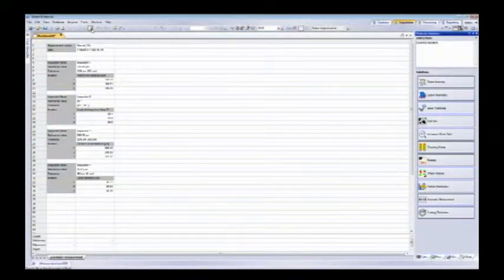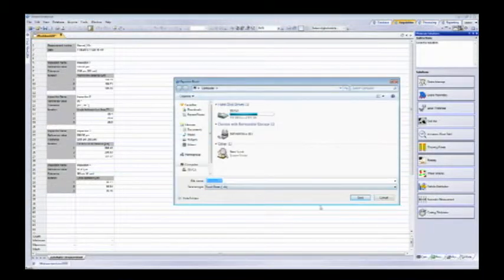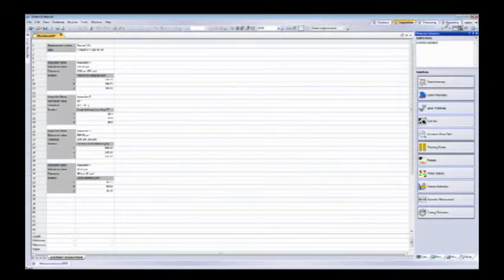One thing to mention, on all these solution modules, when you're finished, you'll get kind of a workbook feature showing all of the measurements and your tolerances. These can be sent right out to Excel or your reports or PowerPoint. So you can export right now. Matter of fact, that looks a little bit like an Excel spreadsheet. Yeah, it's a workbook, and we just hit an Excel button here, and it lets us save out as an Excel document. Or we can go right to our reporting tab and generate a Word document with this embedded into it. Or this could also be a PowerPoint? It can also be sent into the PowerPoint document. Let me go back to you wanted to cover the coating thickness.